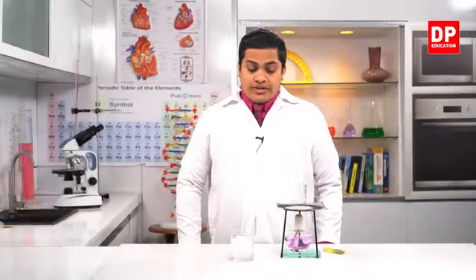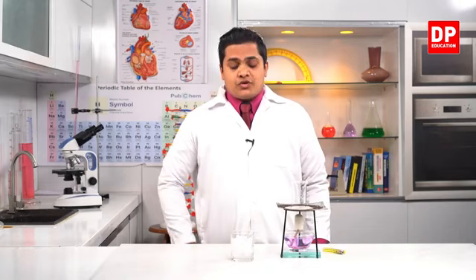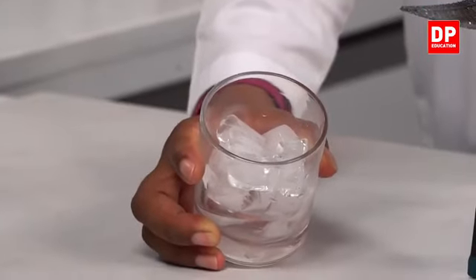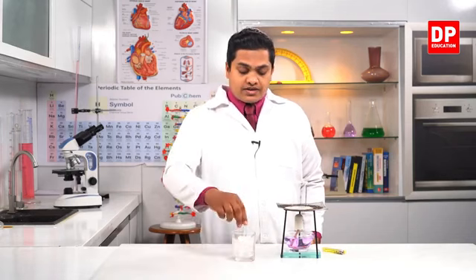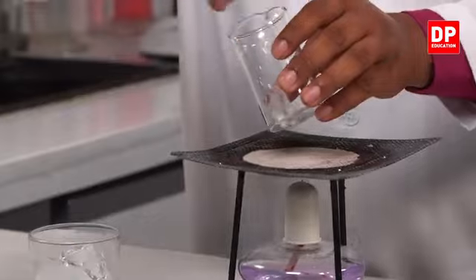Right, my dear children, now in this activity we will be observing some other cases where we can identify state changes in matter. So I have some ice cubes with me right now. You know that ice cubes are made of water. When I freeze water by cooling, ice cubes are created. So I'm going to put some ice cubes into this smaller beaker.